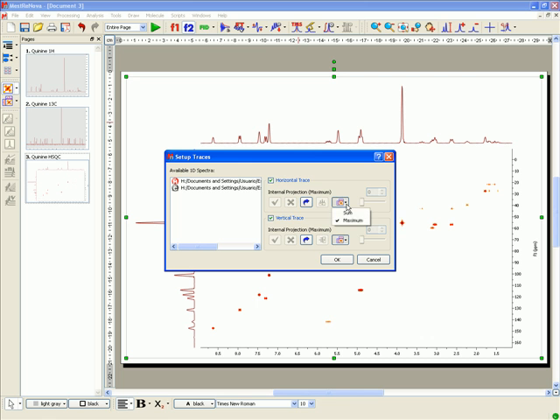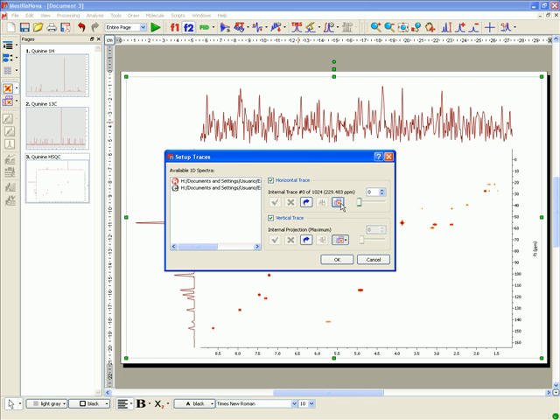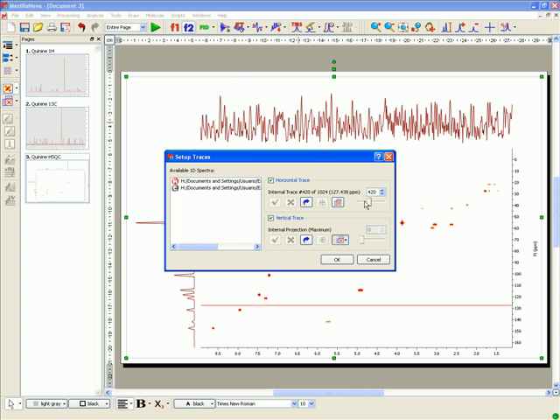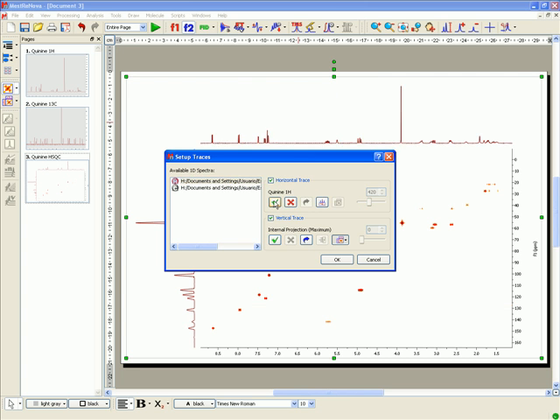Click again on this icon to show the internal traces. You can select any currently open 1D NMR spectrum as a trace just by right-clicking over one of the traces.